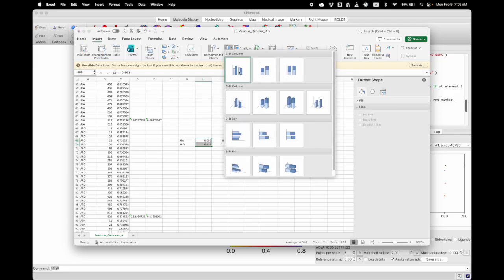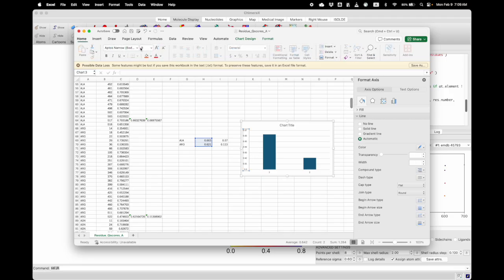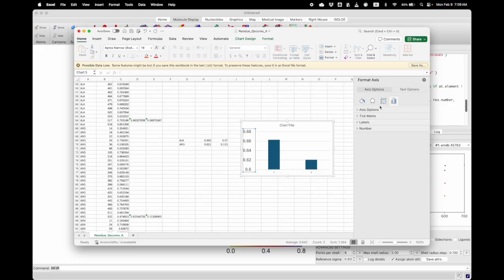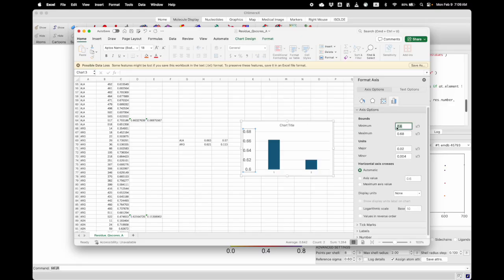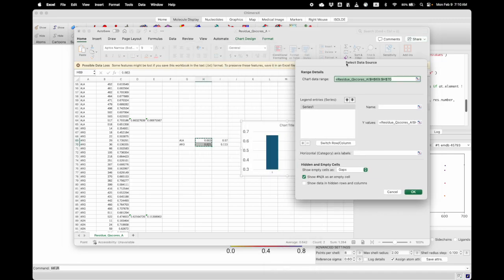In this case, I can use a bar plot, and then here I can control the range, so I can go back to something a bit lower. So they're pretty similar, but there might be different variations for different types. And here I can set the labels to be the names.